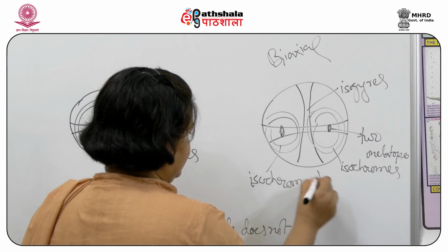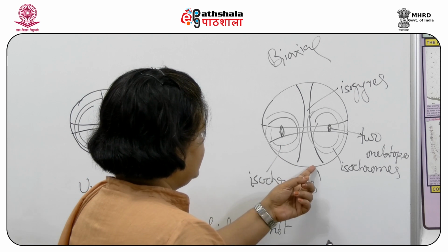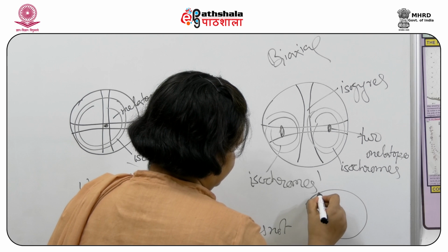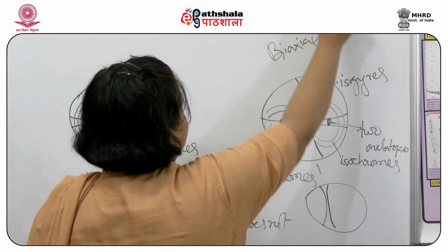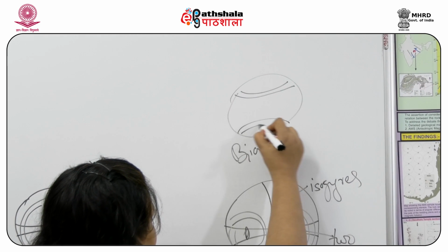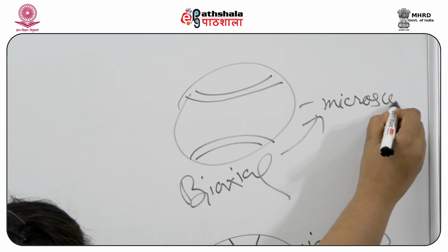And the basic difference between these two figures is that on rotation of the microscope stage, the isogyres will split like this. You can have one isogyre or it can even form a hyperbola like this on rotation of your microscope stage.